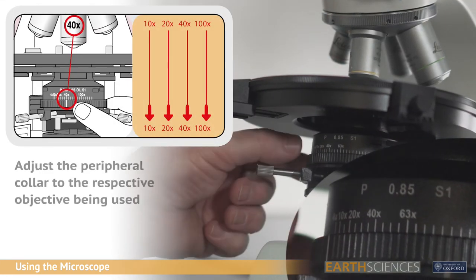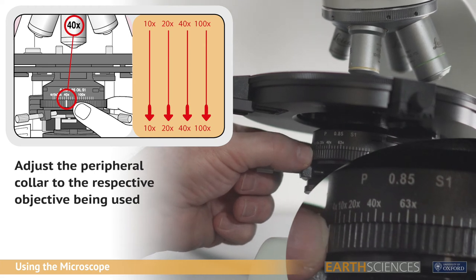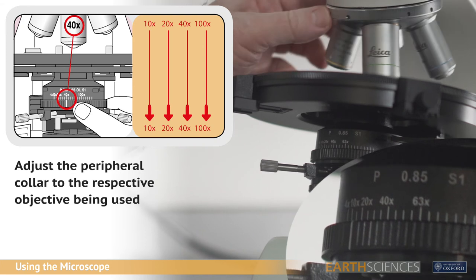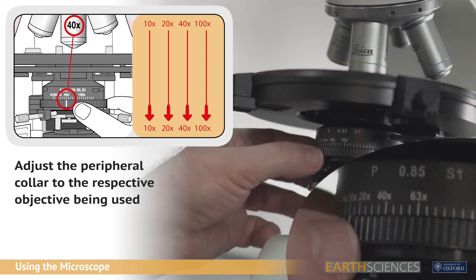The condenser contains the aperture diaphragm which is operated by the peripheral collar. Suggested positions for this in relation to the objective used are shown on the diaphragm.